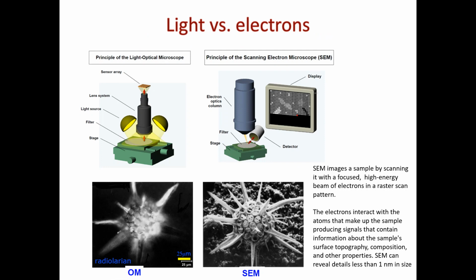Whereas if you look at optical microscopy, where you're just recording what went through, you don't see those details from the surface. You're just recording what got transmitted. Both can be useful in sizing up shape, so I can use both.